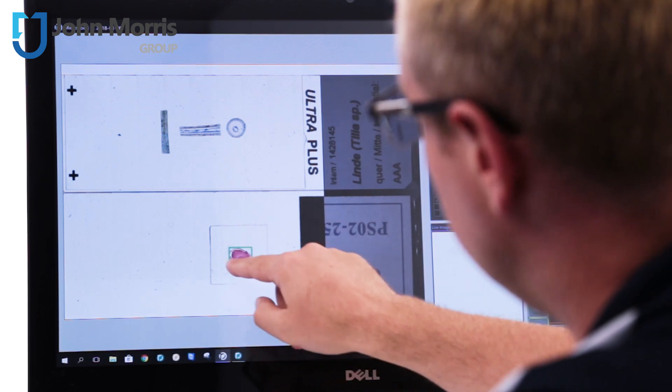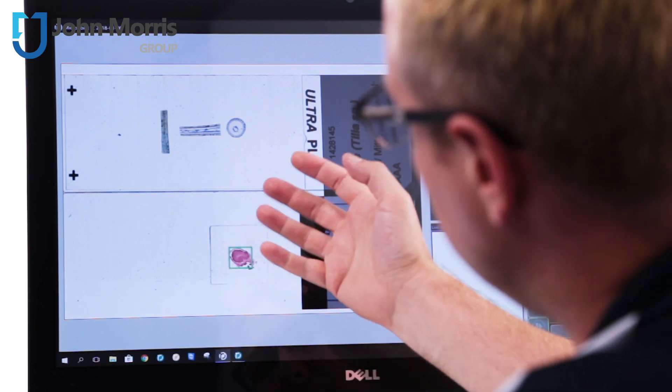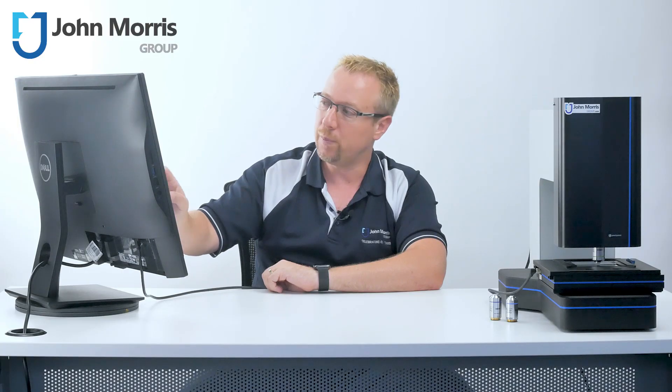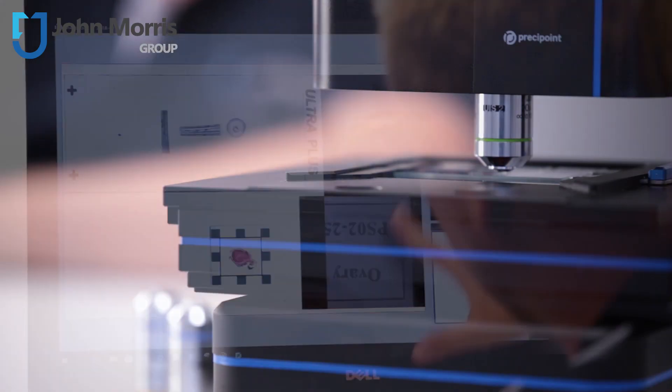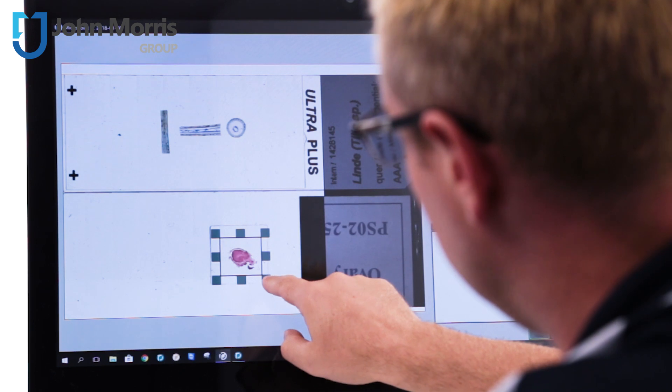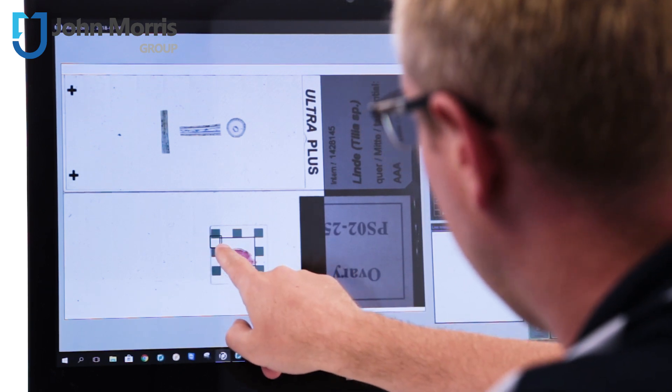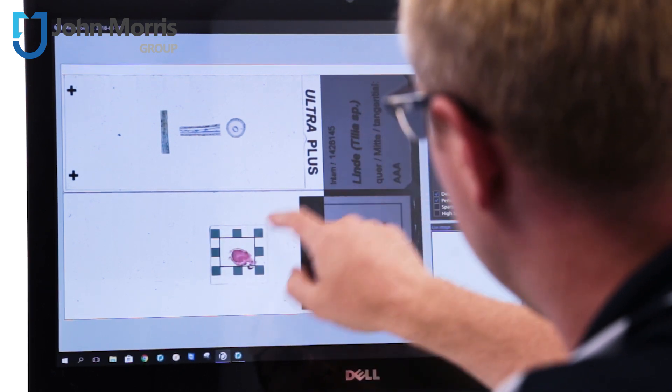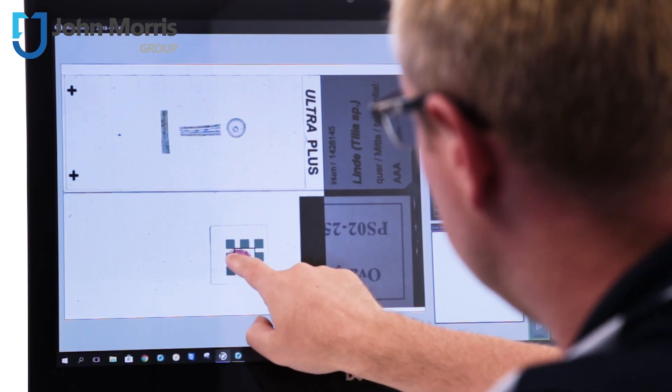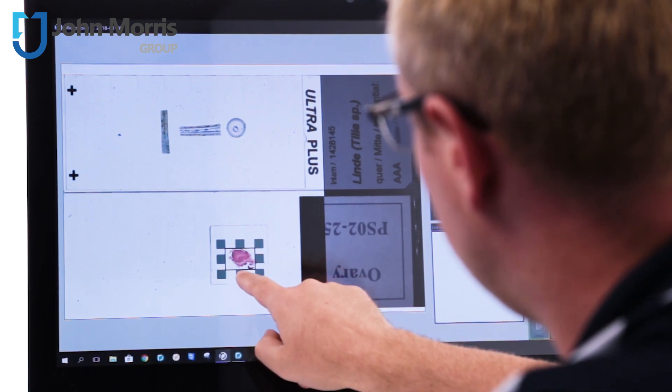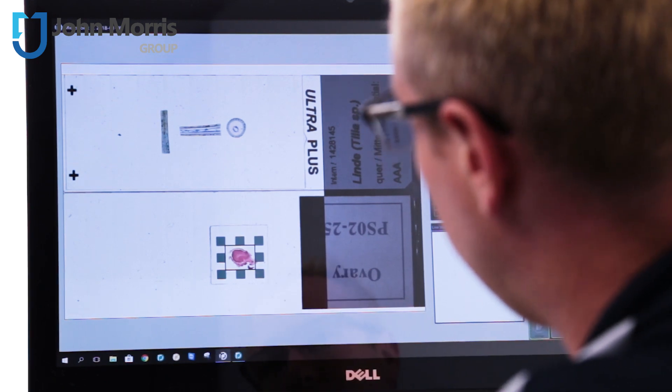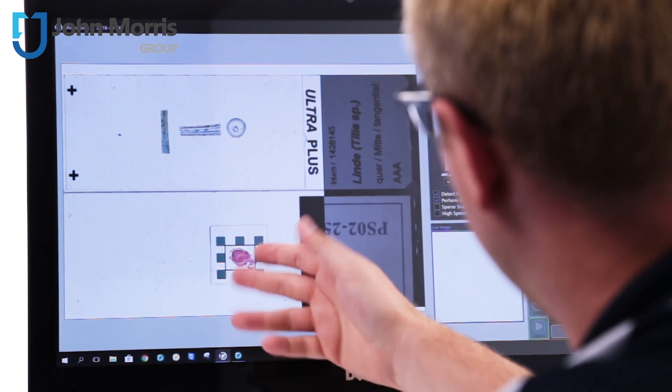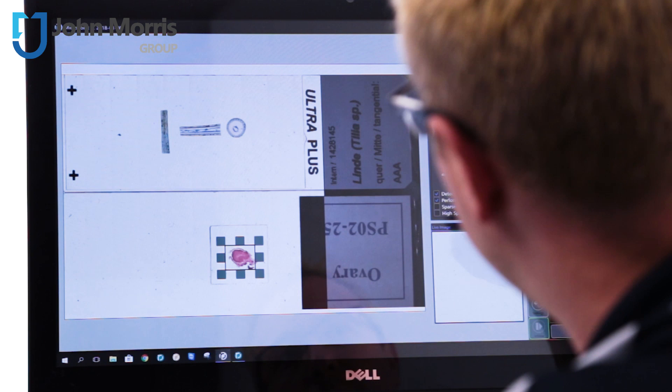So the green box here is the area that we're going to actually scan and create a dynamic file from and then be able to send. What we can do is get a complete copy of the slide that's currently underneath the objective and we're going to define the area that we want to scan. So I want to zoom in and I want to send all of this image right here to my collaboration partners. So here we have it and let's go.